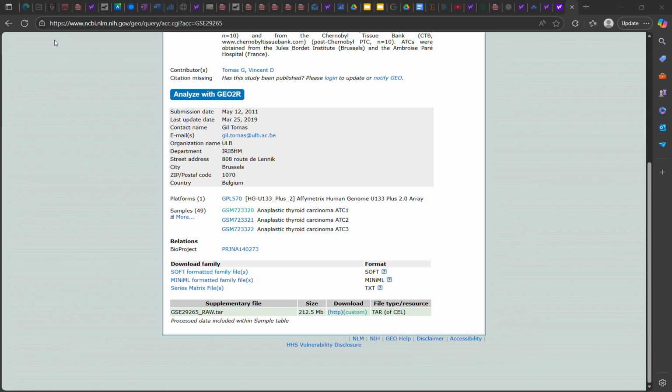Now we're going right back here, and next we have to map the probe IDs to gene symbols. Now here we're going from the normalized expression back to basically the data. And we're going to use two features of the data, which are probe IDs and gene symbols, and we're going to map those to each other because those are the two features we really care about for the feature data in this little project. We're going to run that.